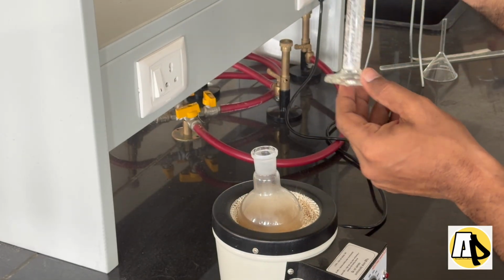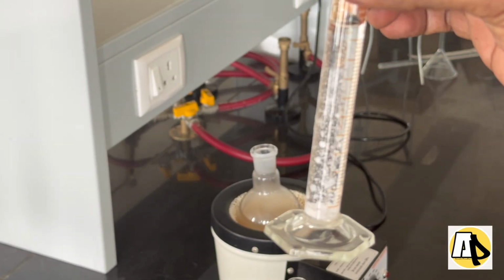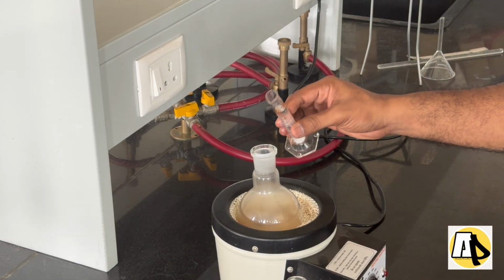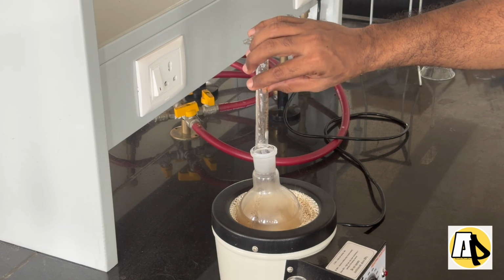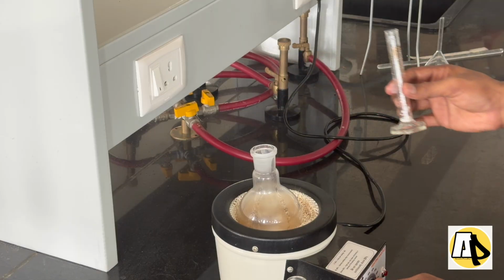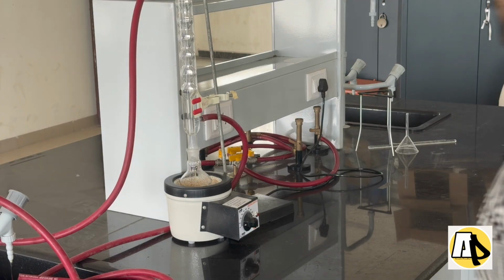So you can see clearly methyl salicylate is insoluble in sodium hydroxide. Since we are refluxing both in the same container, it is not a problem. So this is going to be your reflux setup.